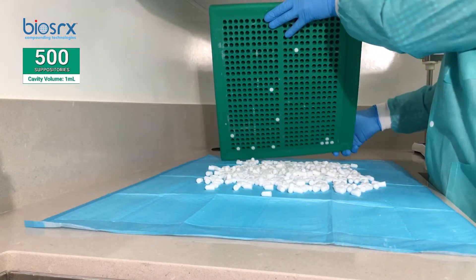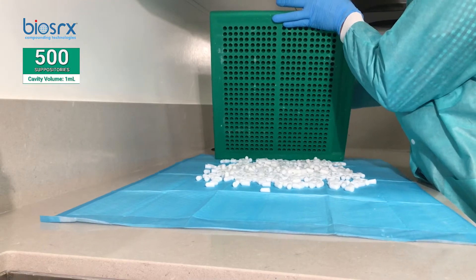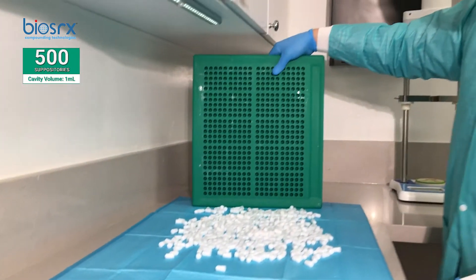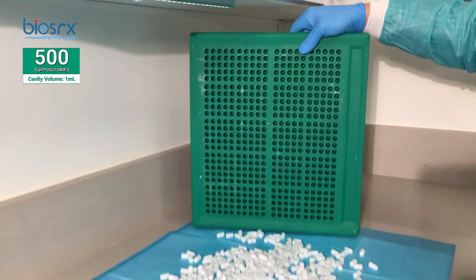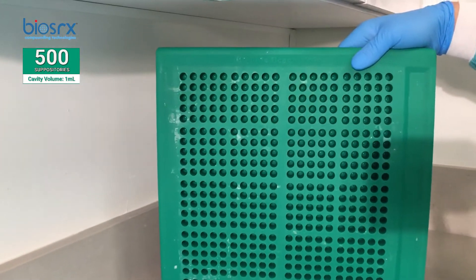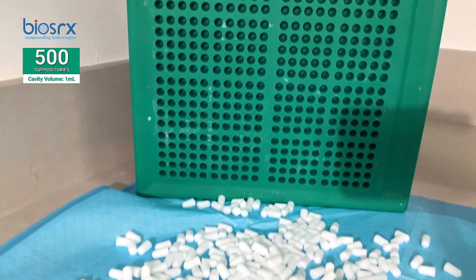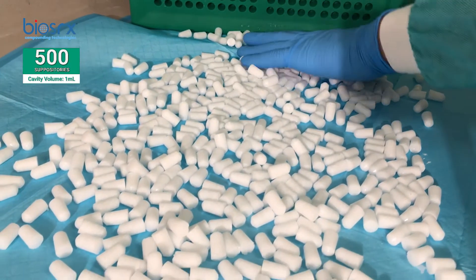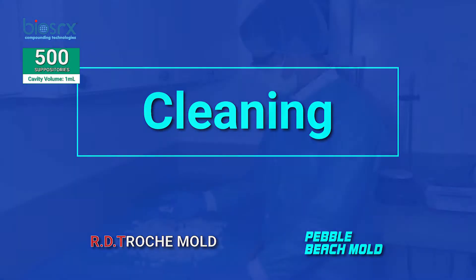There are a couple of stubborn ones left over. Let's zoom in on both the product and the mold — starting with the mold. That's exactly what we want to see. And wow — 500 suppositories.